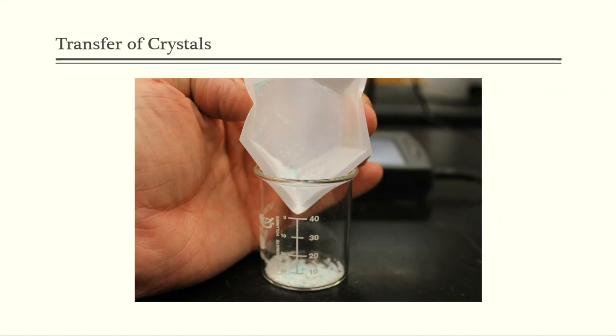Notice here though, on this weigh boat, you see all this remnant stuff. All of this remnant is going to have to get out of here. All of that is product or sample that I need to transfer, and I need to recrystallize that as well, and I can't forget about that. So I never just want to dump stuff into a beaker like I did here and then immediately trash and throw this weigh boat away. There's stuff on there that I need.